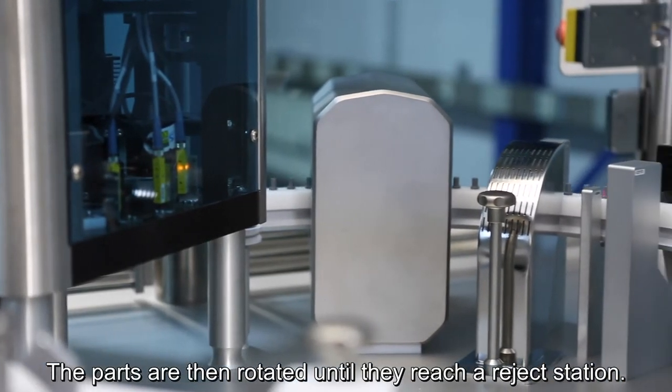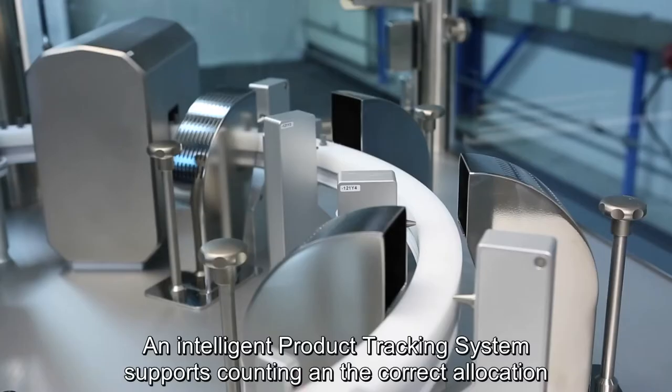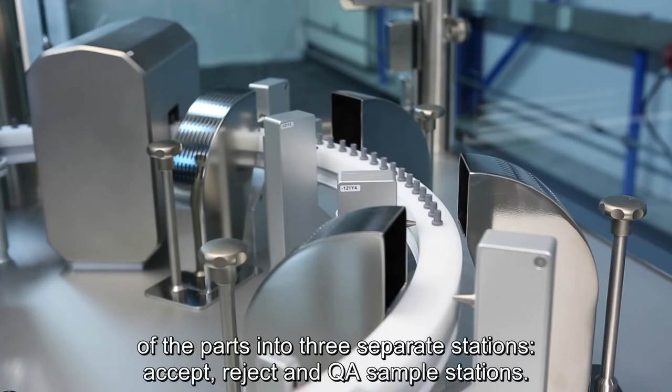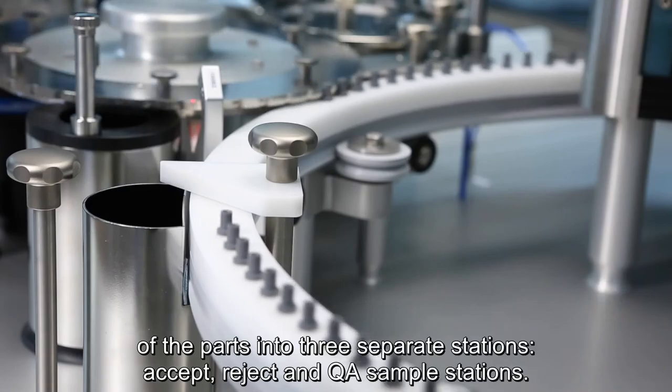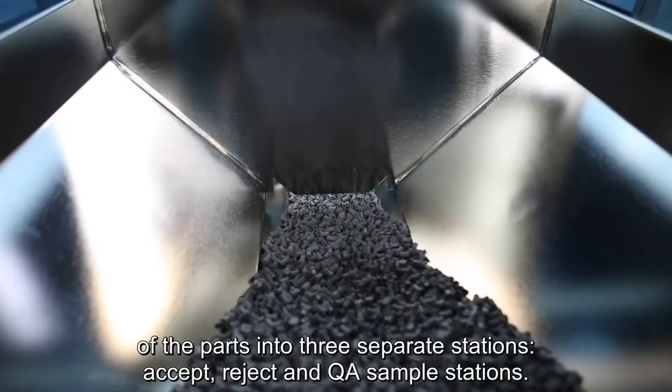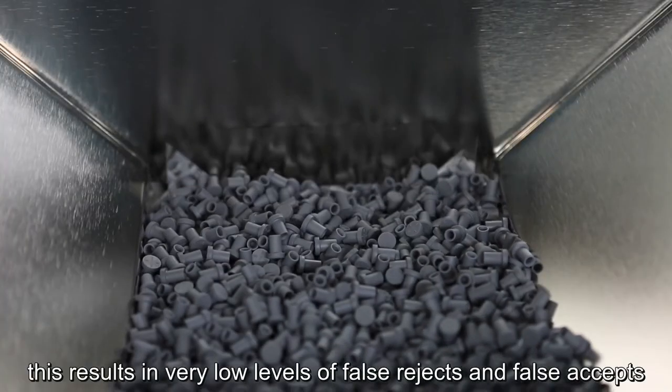The parts are then rotated until they reach a reject station. An intelligent product tracking system supports counting and correct allocation of parts into three separate stations: accept, reject, and QA sample. This results in a false acceptance of less than three products per million.